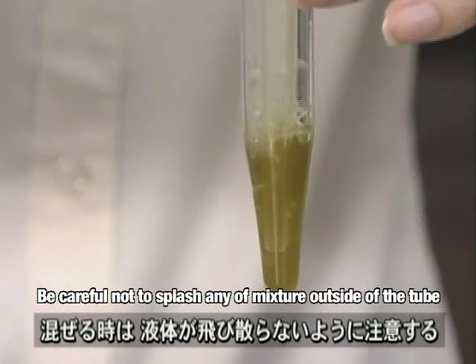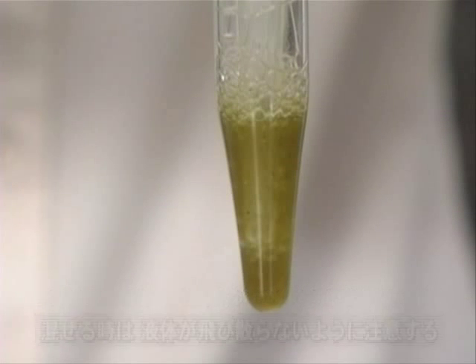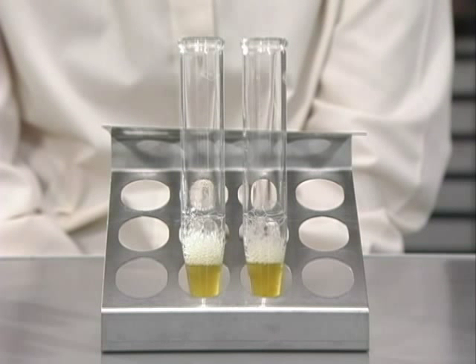When mixing, be careful not to splash any of the mixture outside of the tube. Next, we wait approximately 20 minutes. It is highly recommendable to mix the mixture twice during this time.